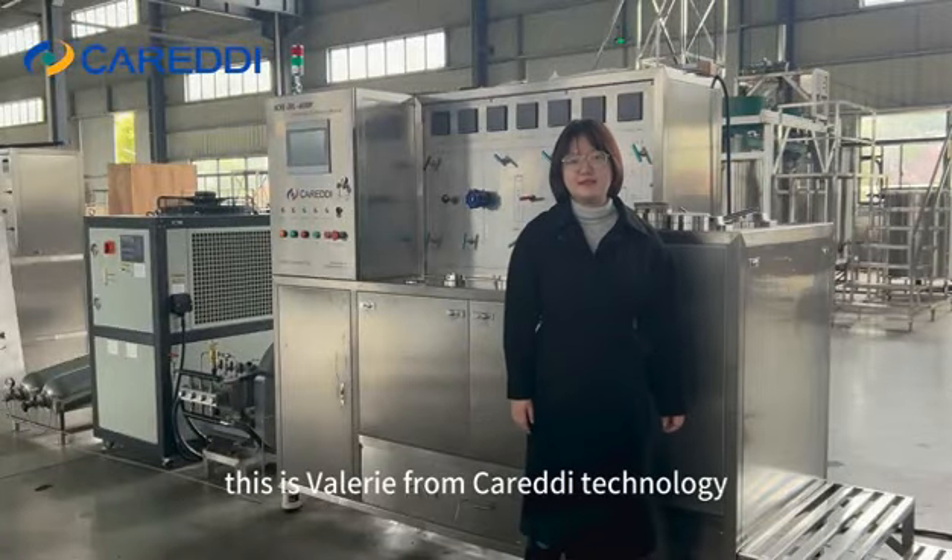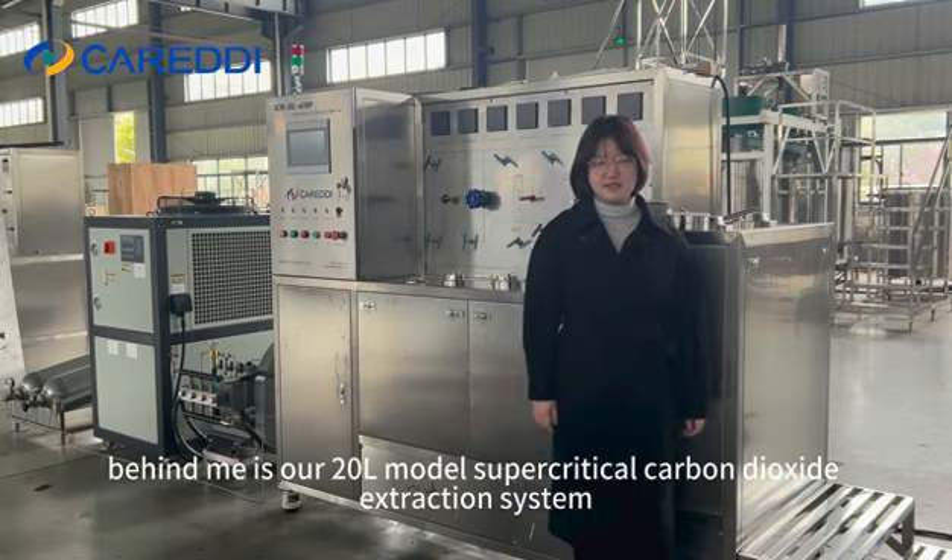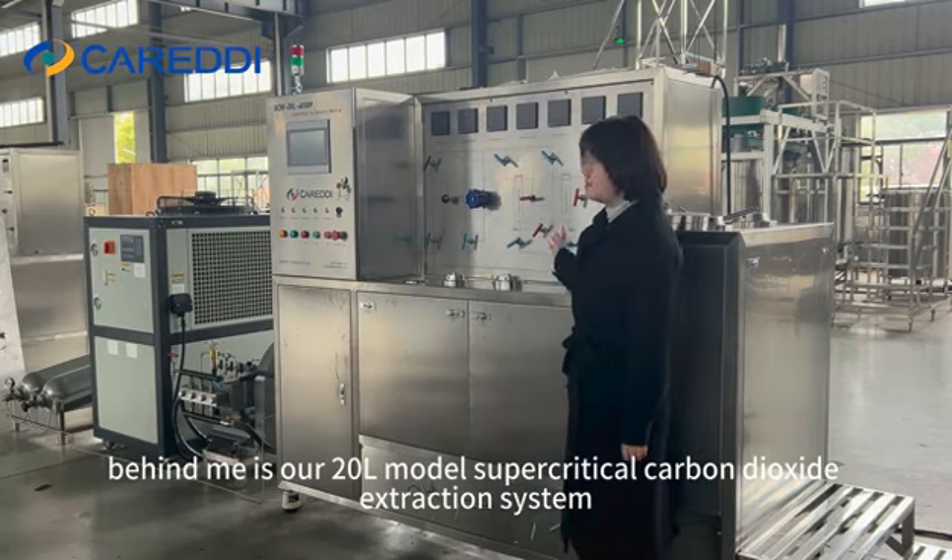Hi everyone, this is Valerie from Careddi Technology. Behind me is our 20-liter model supercritical carbon dioxide extraction system.